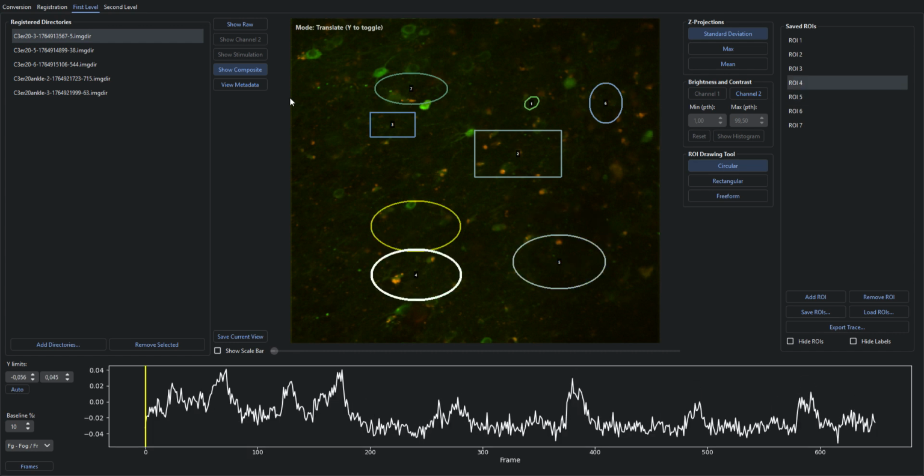Okay, and then now there's also view metadata. It's not complete yet, but it at least shows you like the FOV size, the pixel size. This is correct. The raw JSON, if you prefer that. The show scale bar here to show how big the FOV is. And what else? Oh, and there's the contrast now as well.